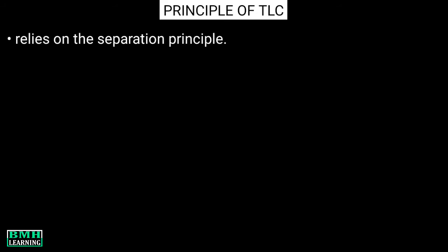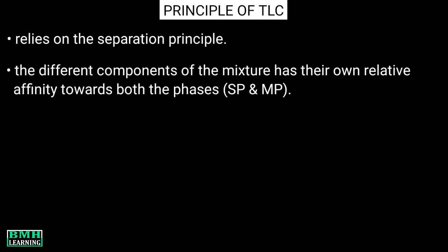Now let's talk about the principle of thin layer chromatography. Like other chromatographic techniques, TLC also relies on the separation principle. The idea of separation is that the different components of a mixture have their own relative affinity towards both the phases, that is the stationary as well as mobile phase.